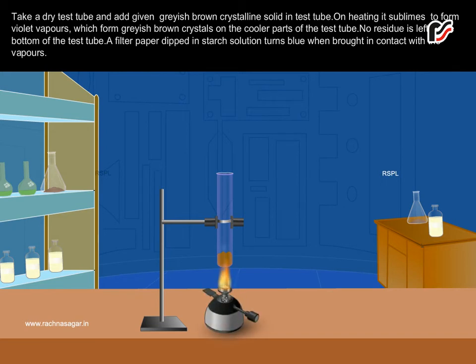it sublimes to form violet vapors, which form greyish-brown crystals on the cooler parts of the test tube. No residue is left at the bottom of the test tube.